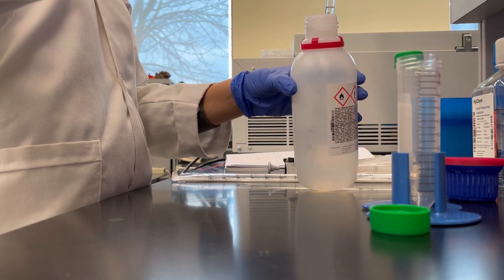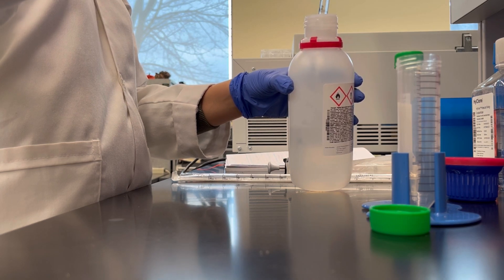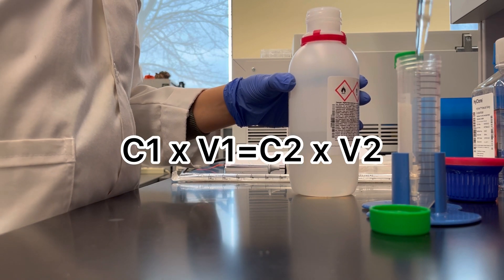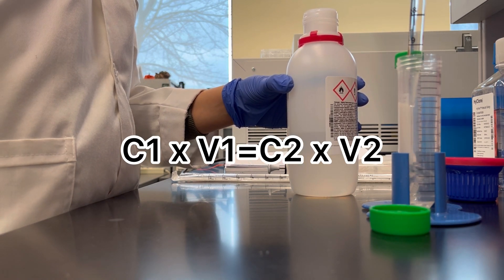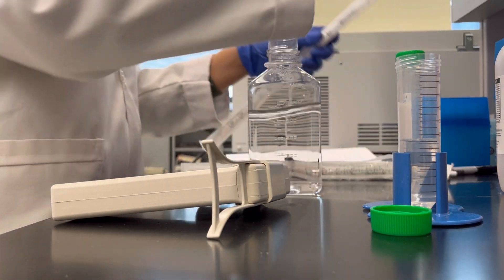In the following steps we need to wash the RNA 3 times with 75% ethanol. Using this equation we will see how much pure ethanol and sterile water we'll need to do so.